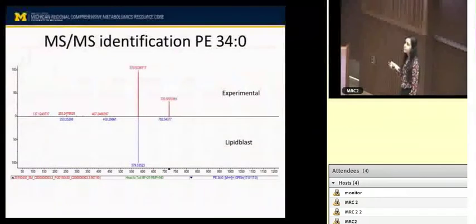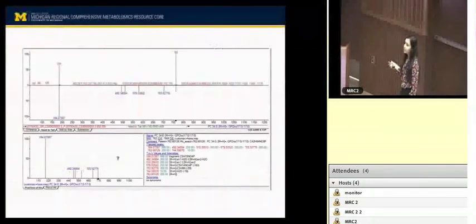Yeah. So, do you know that the library is using the same MS? Like, if you're using CID, do you make sure that the library uses the same thing? This is how you match the fragment ions, or I want to know why the fragmentation that you get is different from the library. Is it because they're using another type of fragmentation?